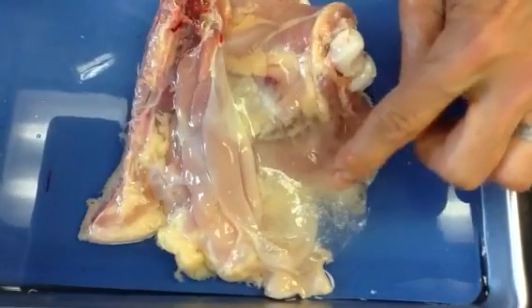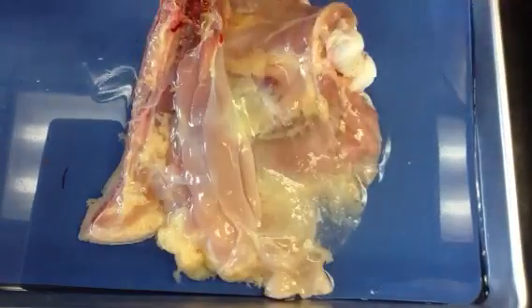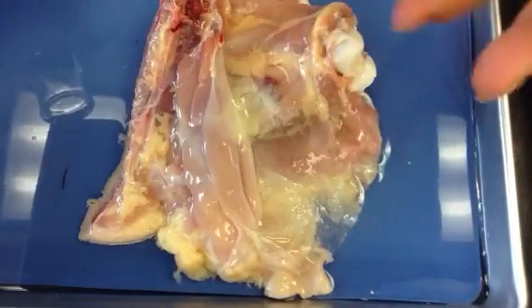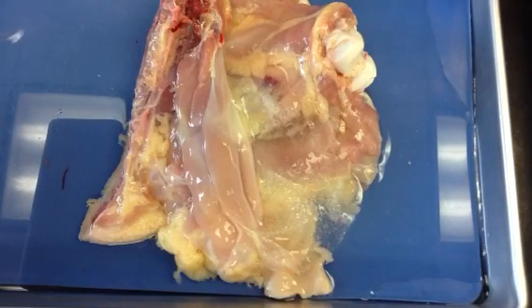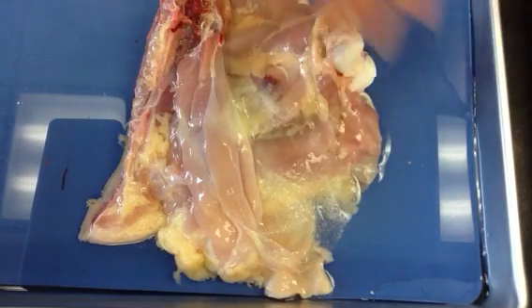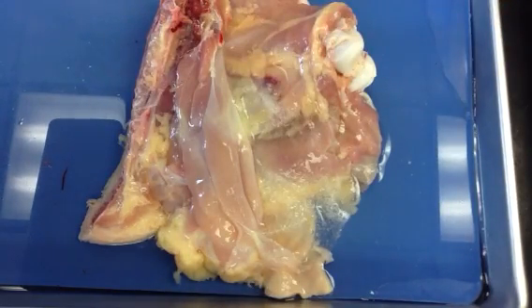Now you can see the white fibers in here that are starting to show up from the heat, as that collagen starts to unwind a little bit, and instead of looking clear, it begins to take on that white color — kind of the idea of how egg whites will turn white when they get heated as the protein, the albumin protein, denatures.